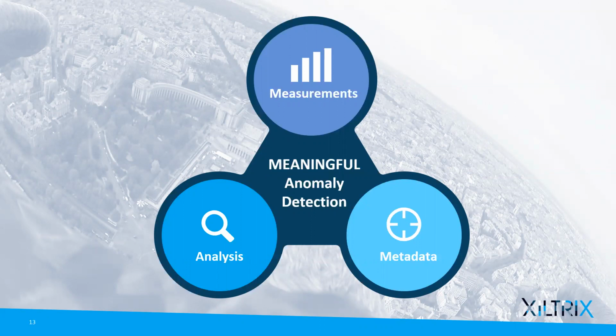We've talked about this a lot. We have the real-time measurements coming from XiltriX, the real-time information that is going to be put in a large database. But from that moment on, we need to go to metadata. And I think, Han, that's again that key point: just taking single points of data and single sensor points is not enough anymore.